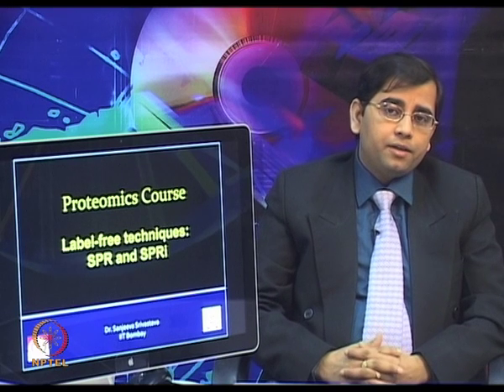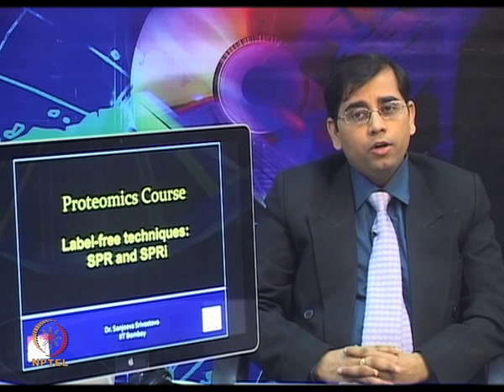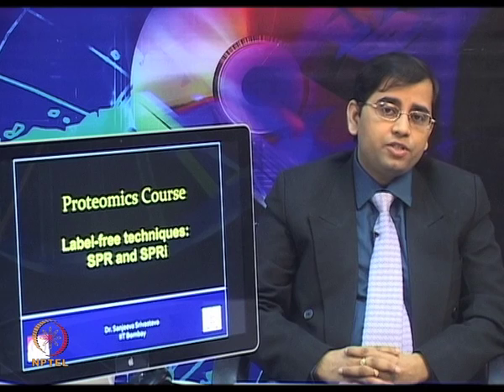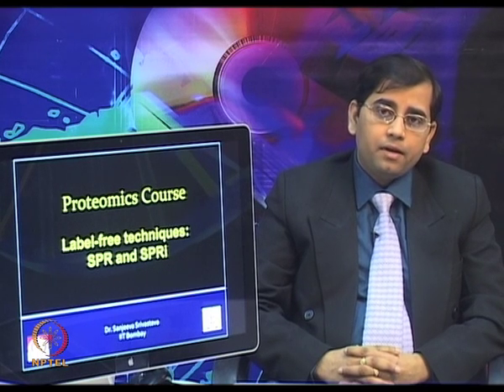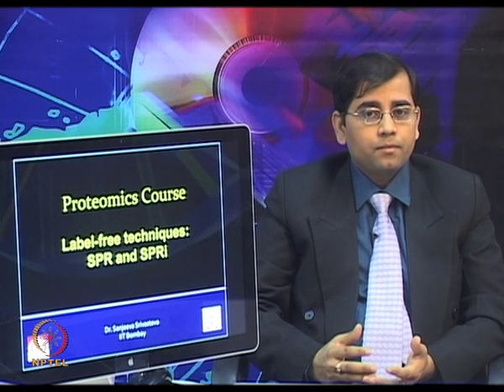The SPR imaging provides an expanded and collimated polarized laser beam which travels through the prism and reflects from the metal dielectric interface.